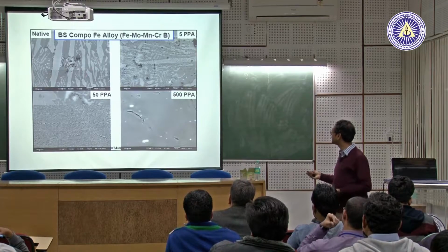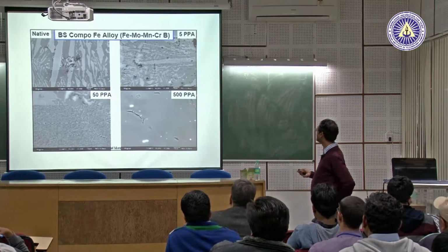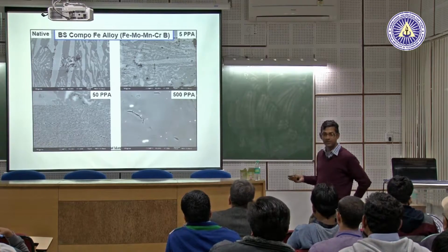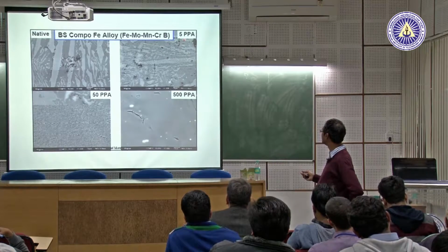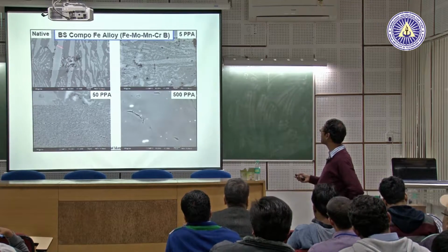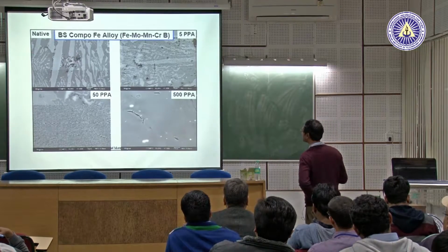So by different coatings, this is a very large amount of coating layers. As you asked, this is very large, this is small, and this is the optimum coating actually. This is the optimum coated sample.